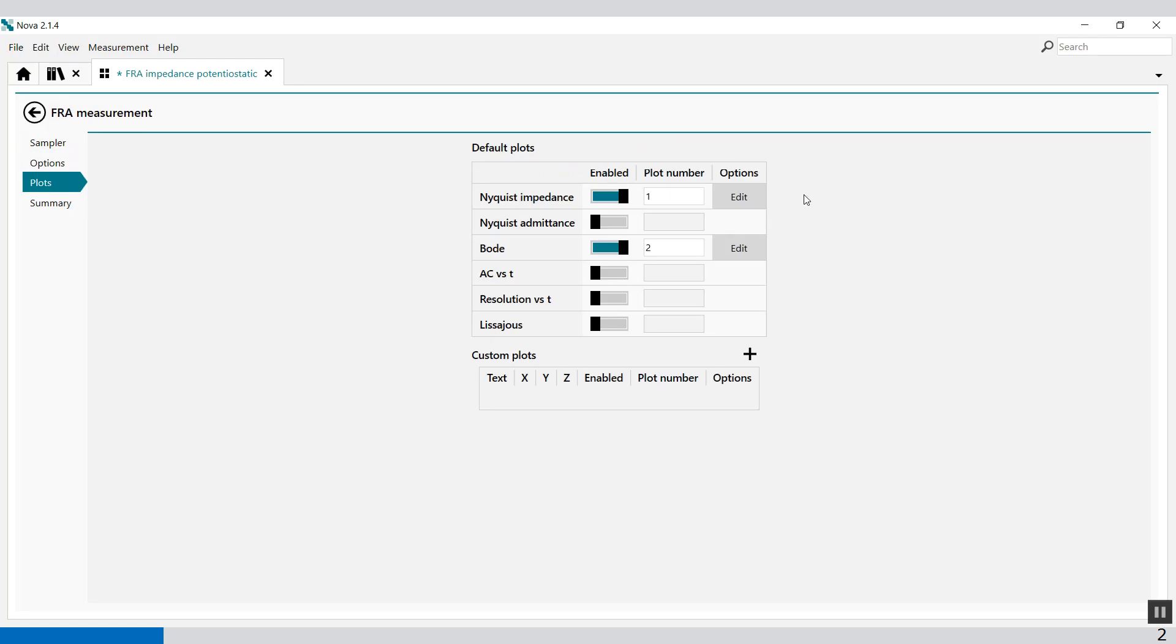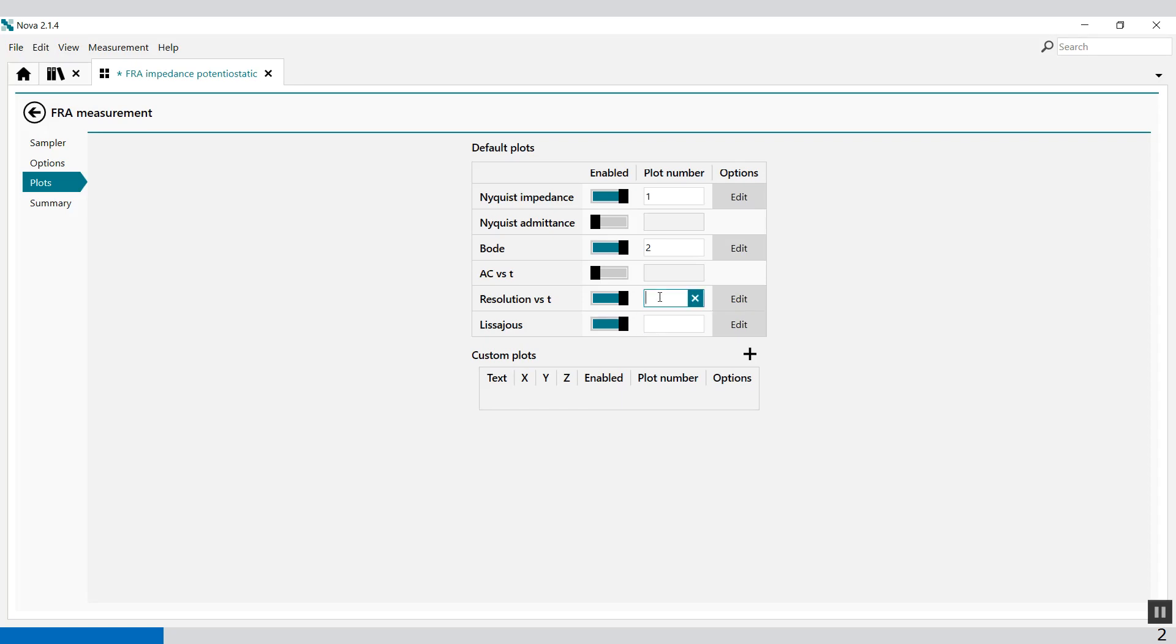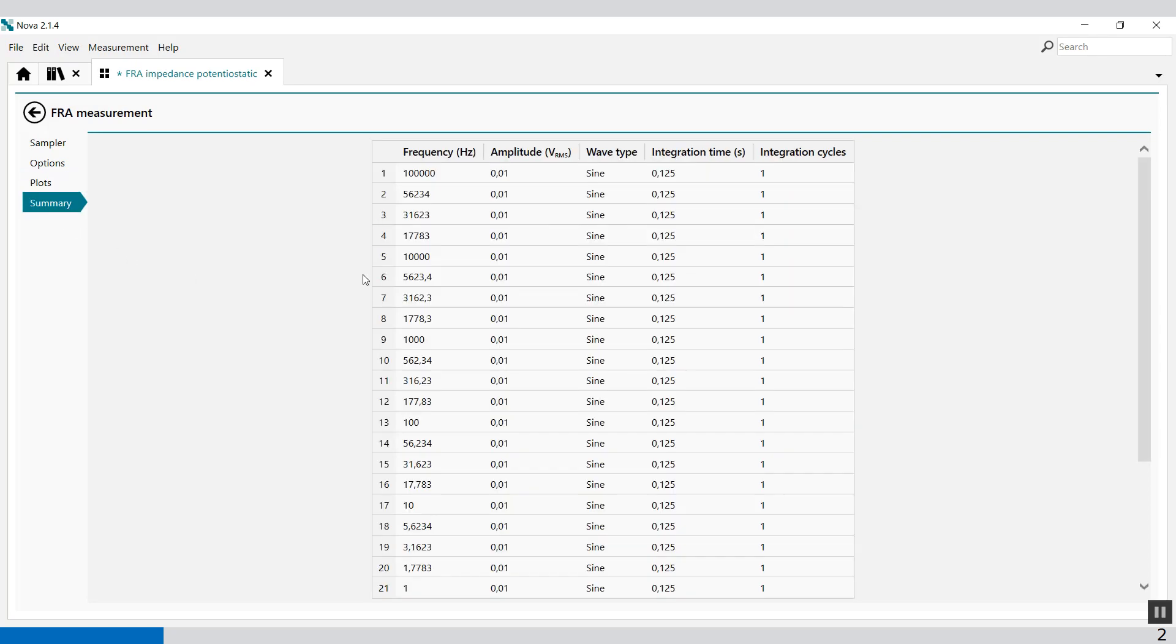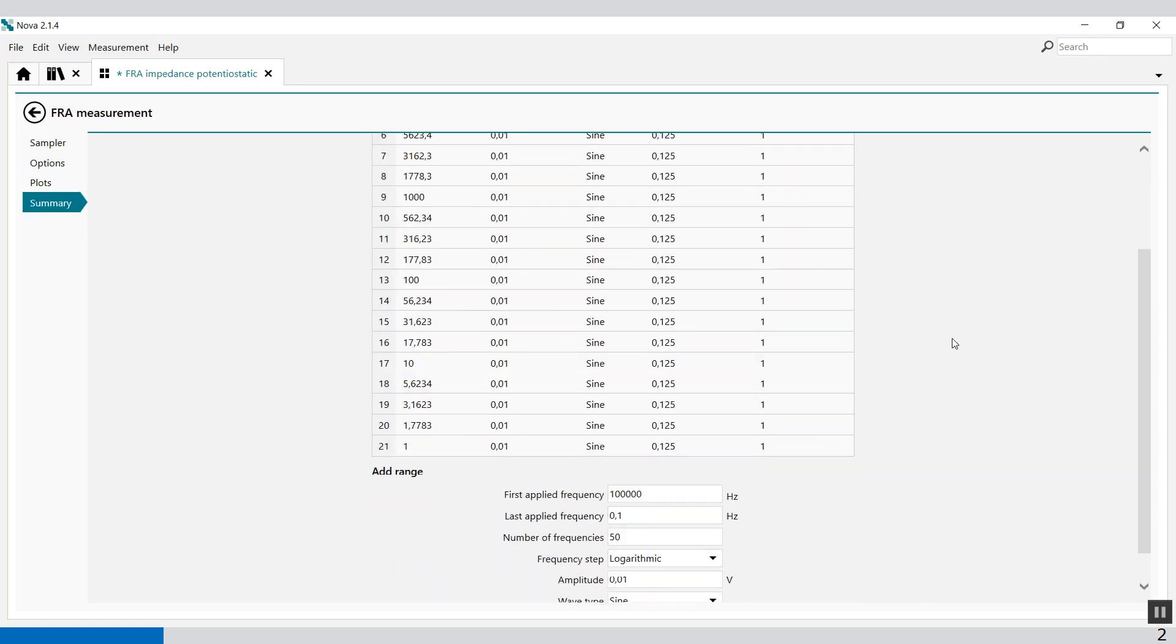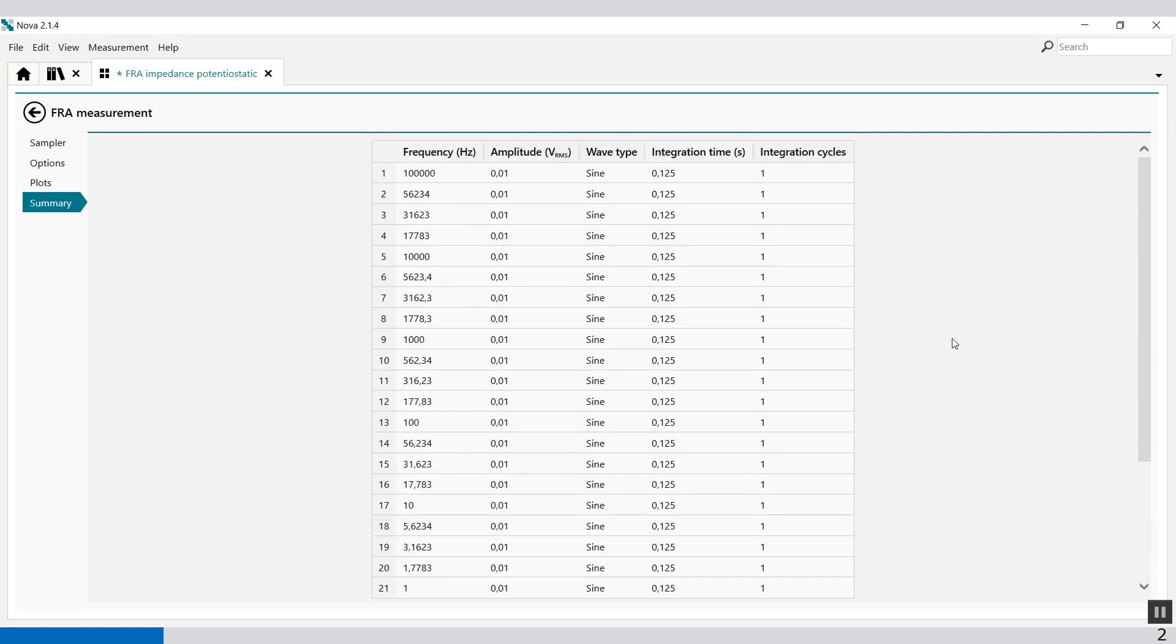In the plots you can define where you want to see the plot. In plot number one you'll see the Nyquist plot. In plot number two you'll see the Bode plot. But you can also switch on the resolution versus time or the Lissajous plot in plot number three and plot number four.